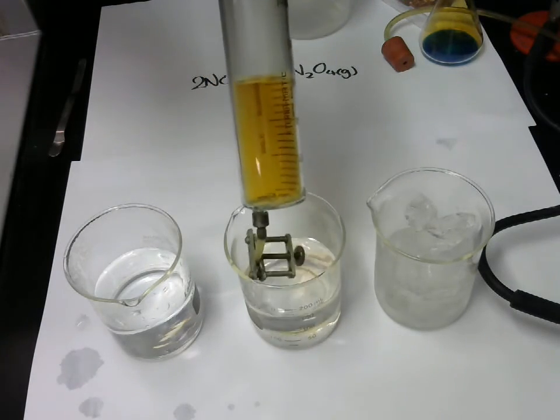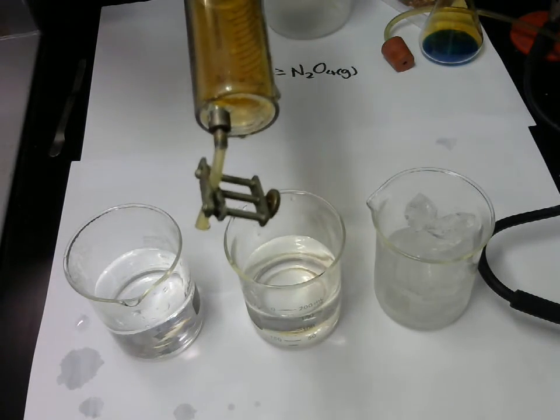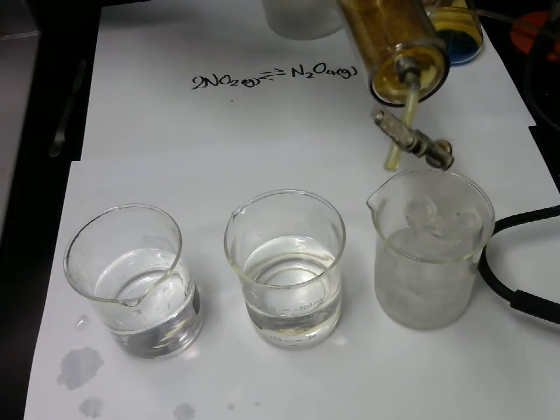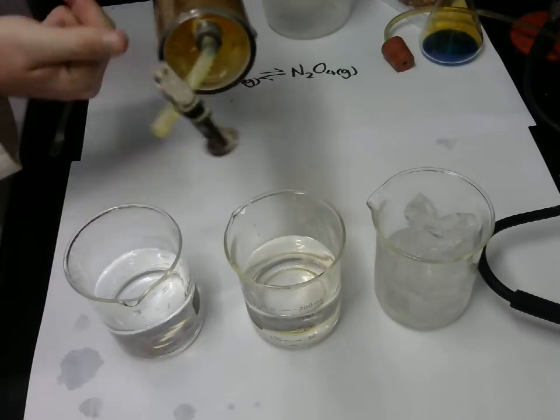if I put it into ice, we therefore would expect it to do what? Lighter or darker? Lighter. Again, you're going to have to hold the syringe because getting colder, the particles get closer together, so it's going to try and pull the syringe in.